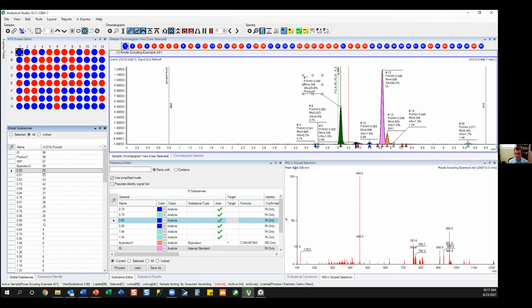And so you might be able to then focus in on this particular peak, look at the mass which is present. So here, of course, it might be whatever this is at 454 Daltons. And then you can, with your knowledge of the chemistry of the reaction, make some determination about the formula of this particular peak.